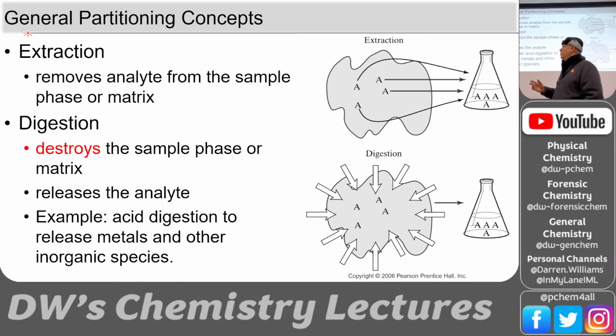Now, digestion is even more destructive, right? It destroys the sample phase or matrix and releases the analyte. And so some of these digestion techniques are pretty aggressive and can be dangerous. So you've worked with nitric acid in lab, you've worked with hydrochloric acid. Those are in pretty concentrated form. They're very aggressive. They'll burn your skin. Occasionally people will have their backpacks on the lab bench and they'll spill some nitric acid and it will destroy the nylon of the bag. We've had straps from backpacks just get all mushy and gooey and nasty. It just starts to destroy the polymer. So we say no backpacks on the lab bench.